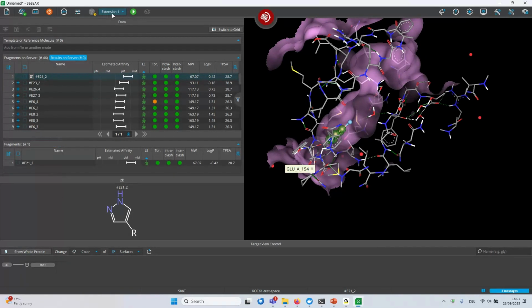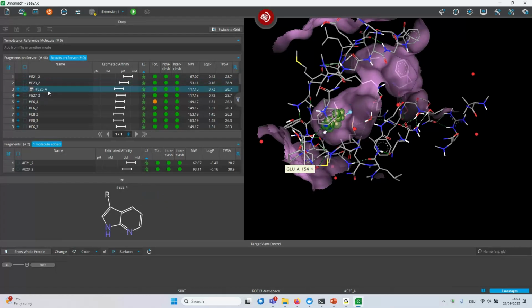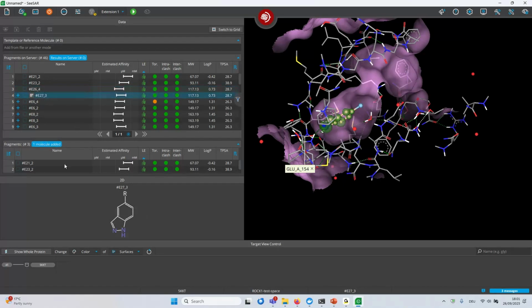And you see that now this became populated. We can, for example, this one also creates the right connections. And I like the positioning of the growing vector. This is also cute. And we can continue like that. We can maybe do something even more different. Let's see.